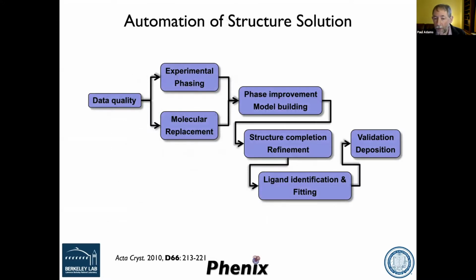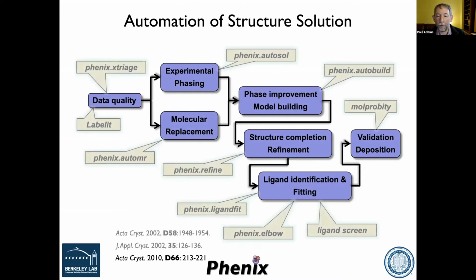In the context of crystallography, this is how crystallography works on a good day, in terms of all the steps you go through to solve and finish a structure. So in PHENIX, we've developed over the years things that are designed to address these different steps.